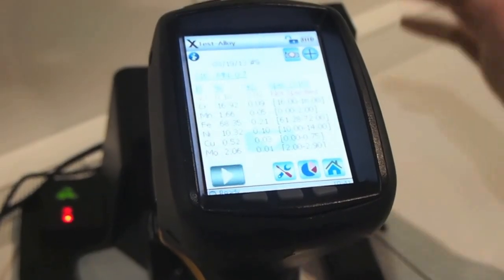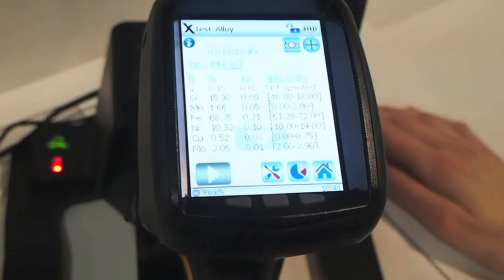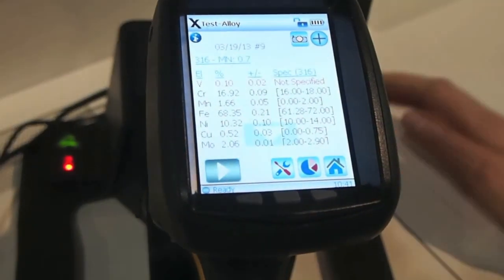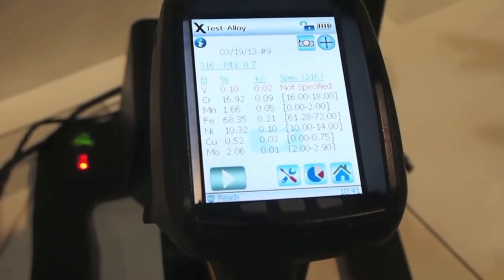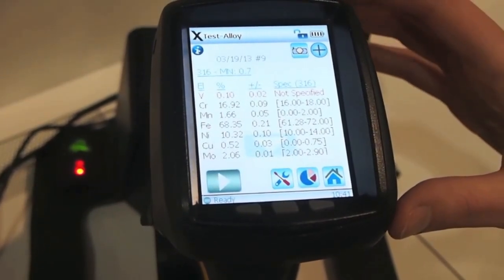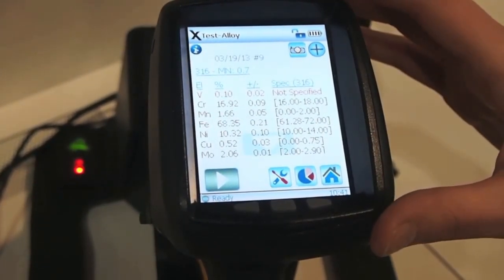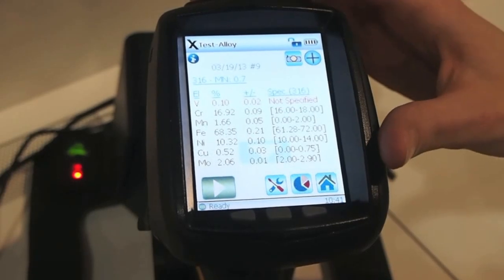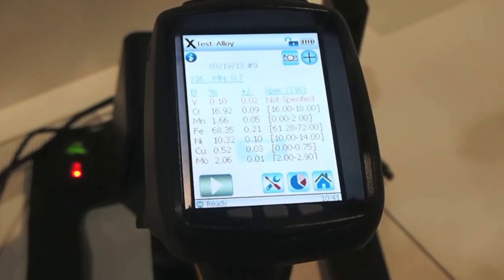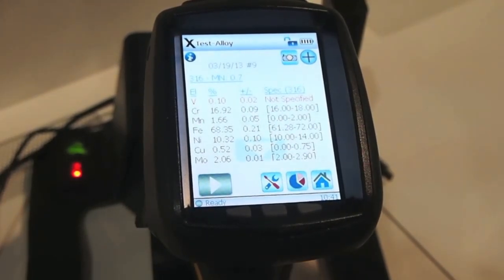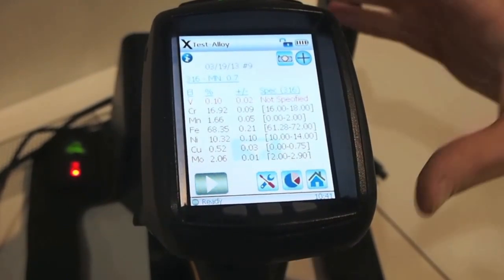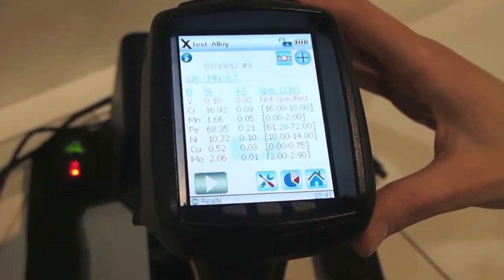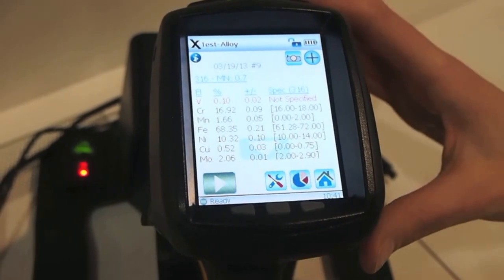So if I go to our test screen you can see an alloy test that I've already done. This technology displays the elements that are in a material and then their concentrations. In an alloy application we can then match that chemistry to a particular alloy grade for fast identification of an alloy for positive material identification.